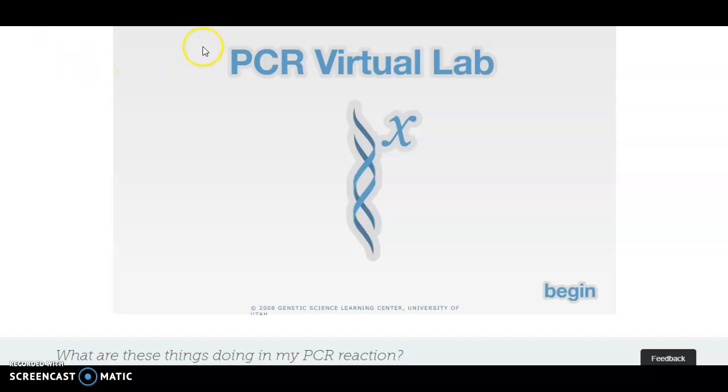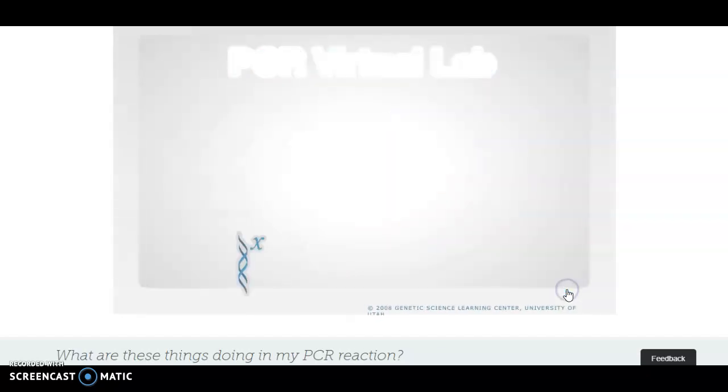Okay. So I will give you the link to the PCR Virtual Lab through the University of Utah website. It is going to look like this. And where do you think we're going to go first? I think we're going to go to begin. Now, I'm going to go ahead and read the slides. I'll describe them a little, and then we'll run through it. Hopefully, we can get this done in the 15-minute time frame that we have.